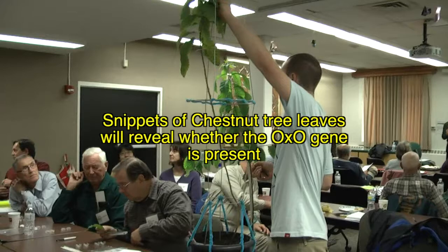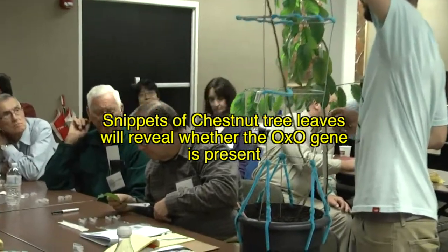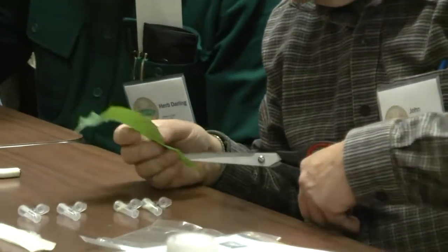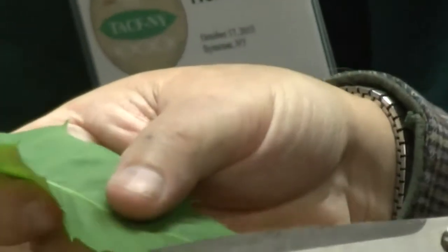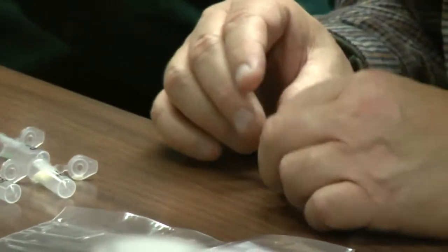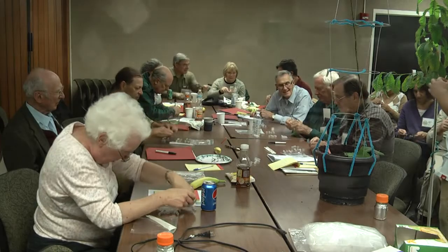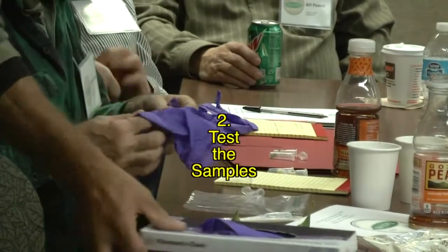So, it doesn't matter what part of the leaf you take, you just want to avoid the mid vein. So it's just going to want to be something on one of these sides here. So I'm passing out leaves right now that are the pink labels, so don't mislabel them, otherwise it'll seem like I'm wrong. If you take the top and push it in, and then go through.